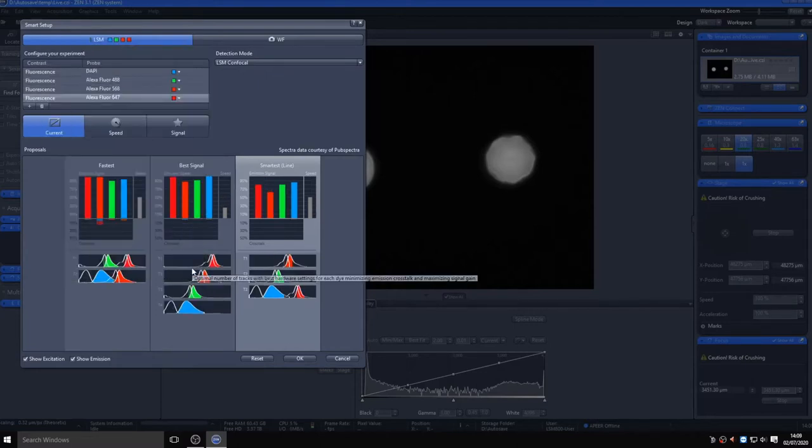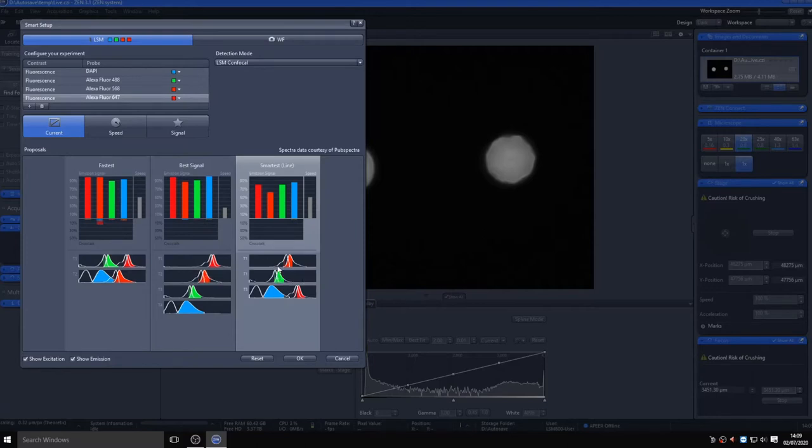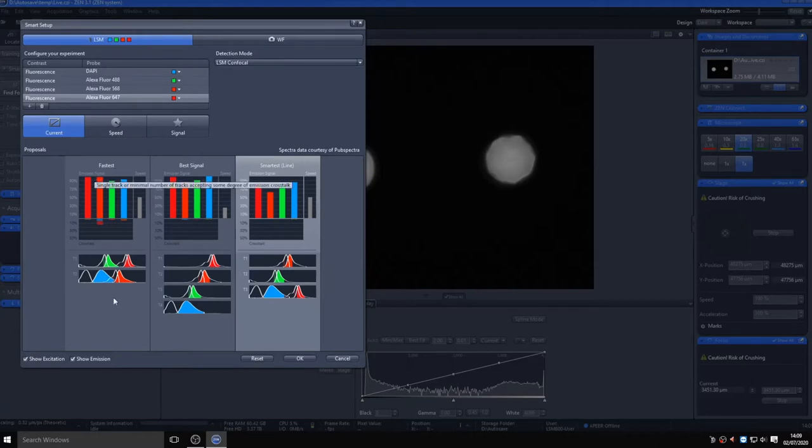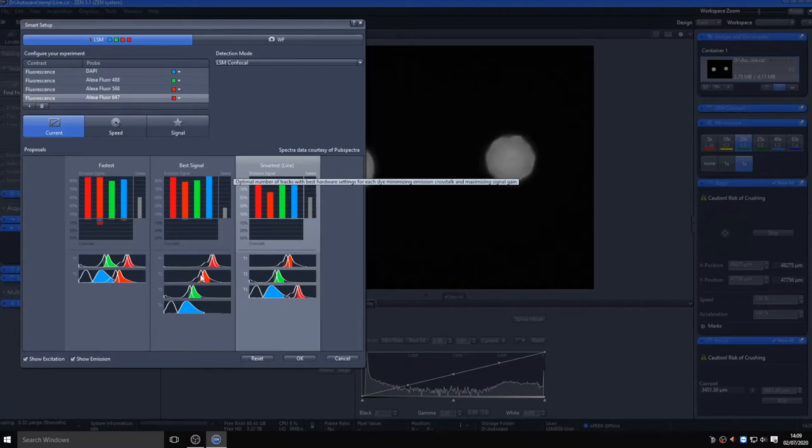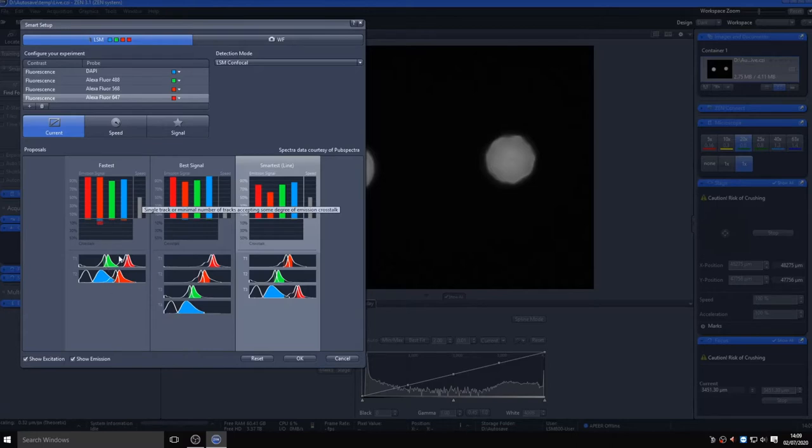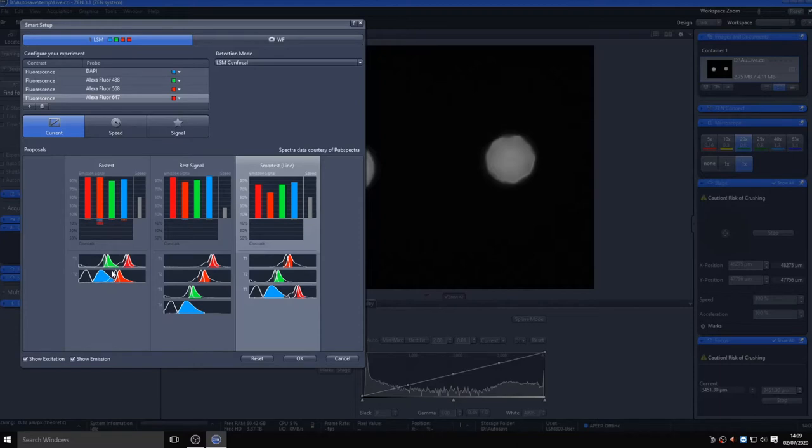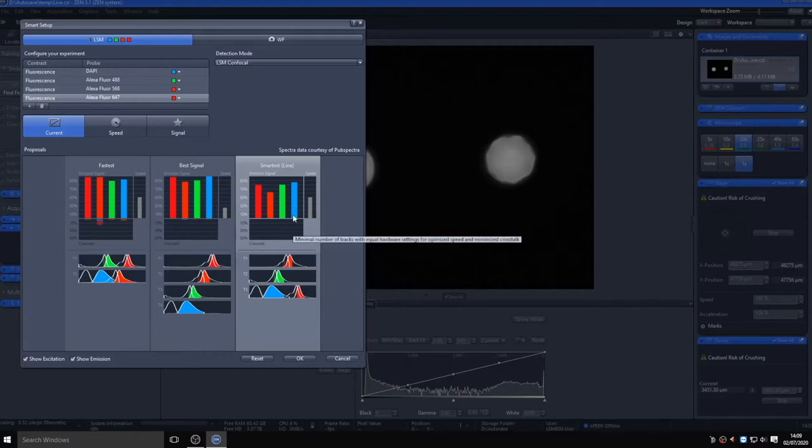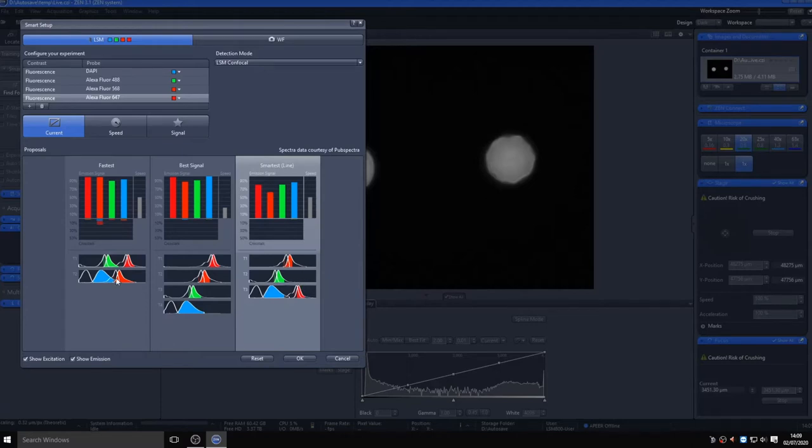You now have the option of choosing different ways to image these fluorophores: best signal, working sequentially through each of the channels to optimize emission capture; fastest, visualizing multiple channels at the same time to minimize acquisition speed but at the cost of increased crosstalk between fluorophore channels; and smartest, which finds the best compromise between speed and signal. You will notice a representation of speed and crosstalk showing which channels are likely to interfere with each other, with crosstalk shown as negative bars on the graph. I will go with smartest here.